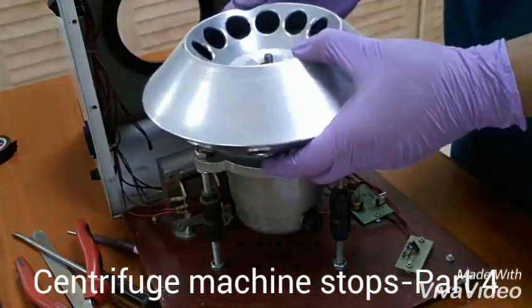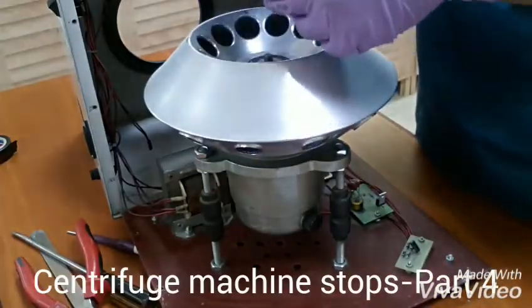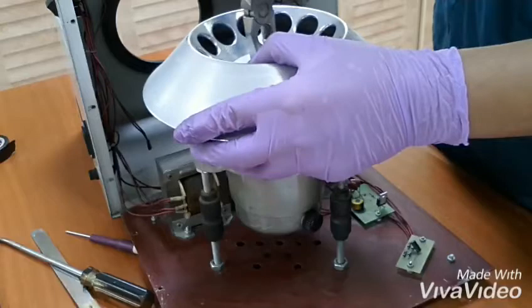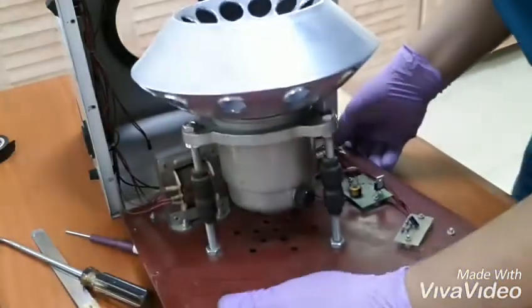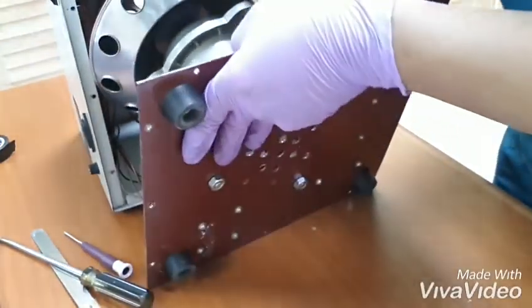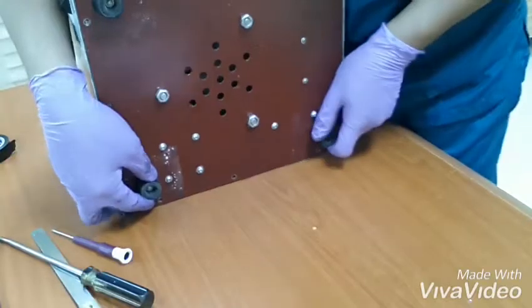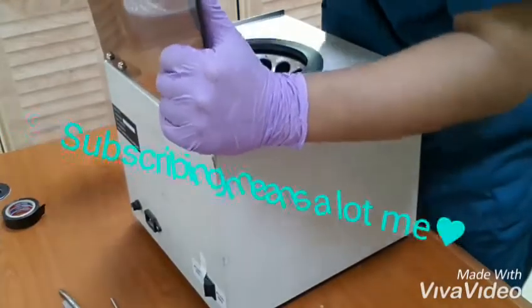We put this one, and then this one, and then the screw. And then the screw and the screw and then the screw. So, let's go.